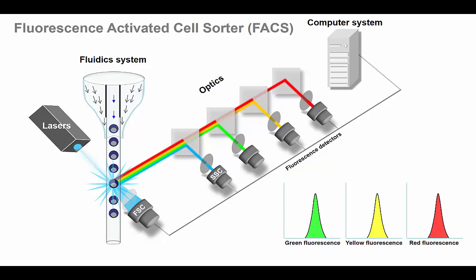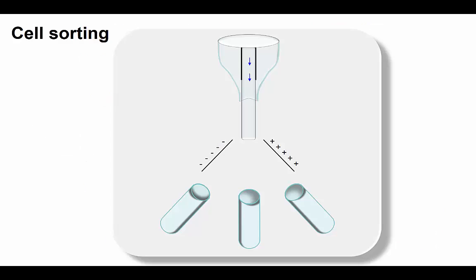Combined with fluorescence, flow cytometry can be called a fluorescence activated cell sorter, abbreviated as FACS. Utilizing this FACS technique, not only just counting the cells, depending on the fluorescence signal, we can physically sort out those cells, green cells and red cells. We can isolate them, and those cells are still alive. That means isolating the cells in live status, and reculture and utilization are possible.